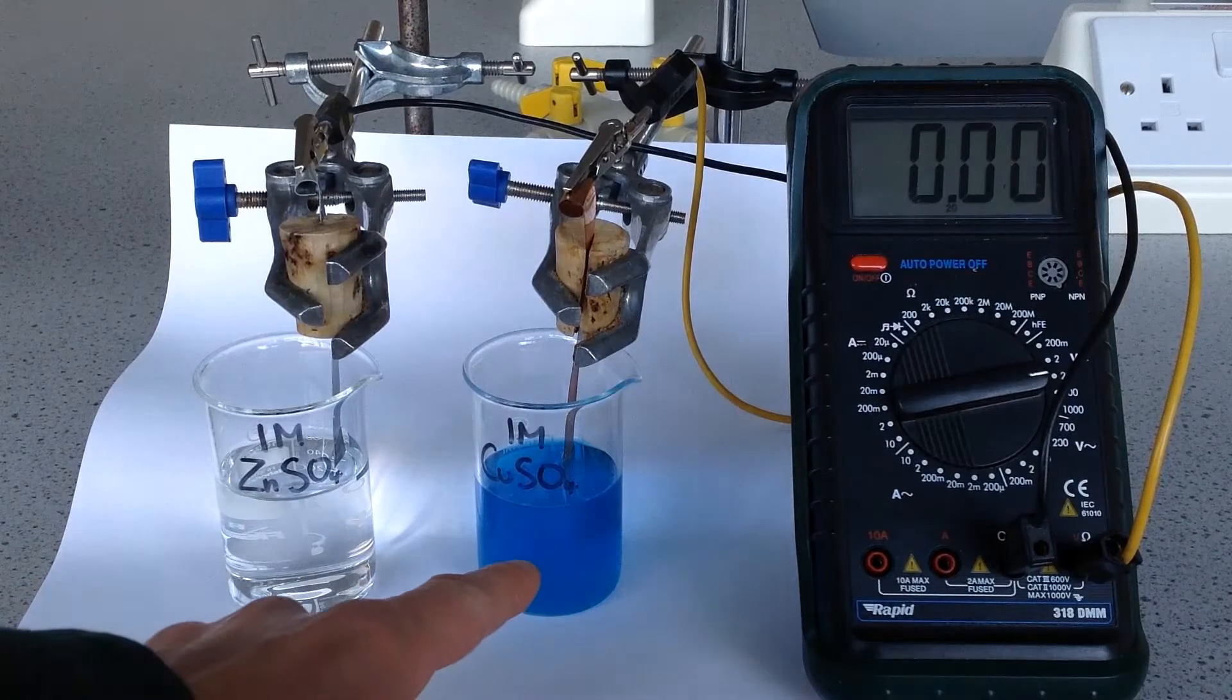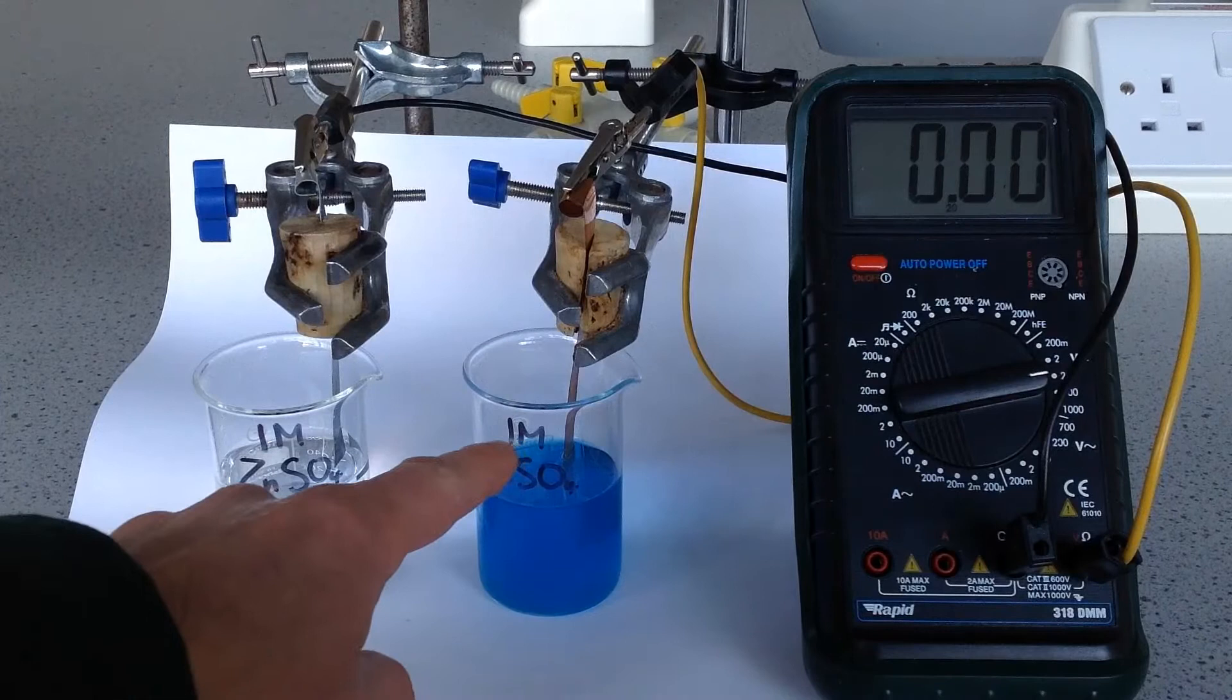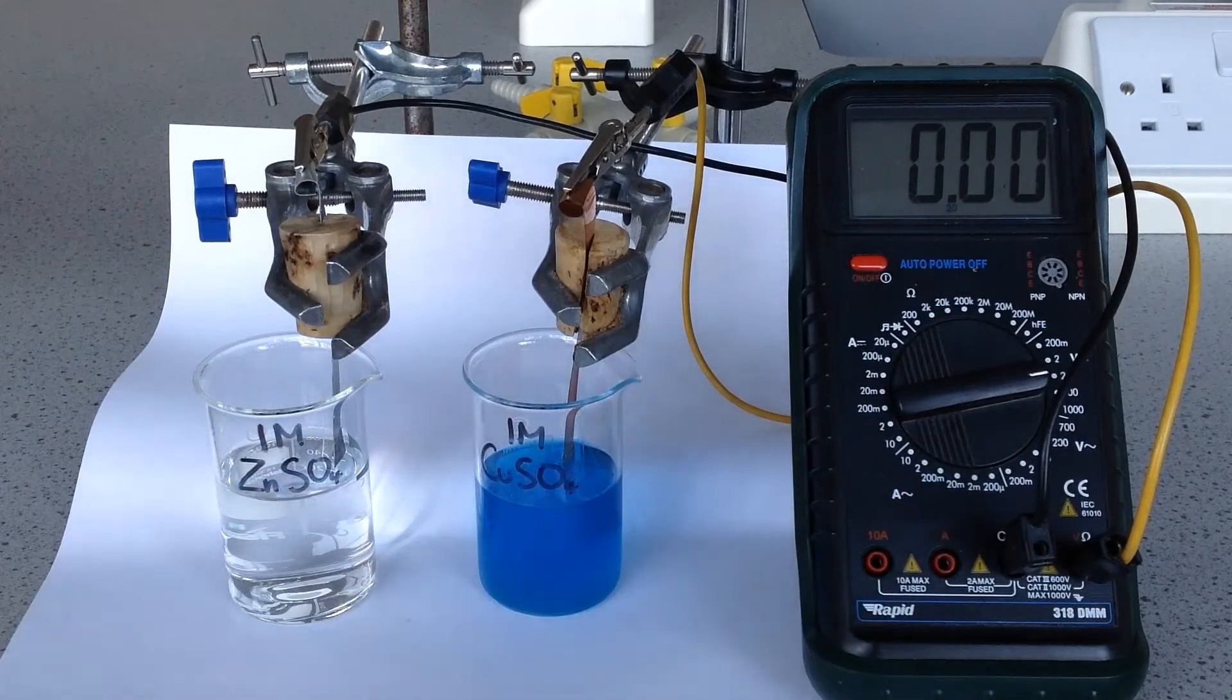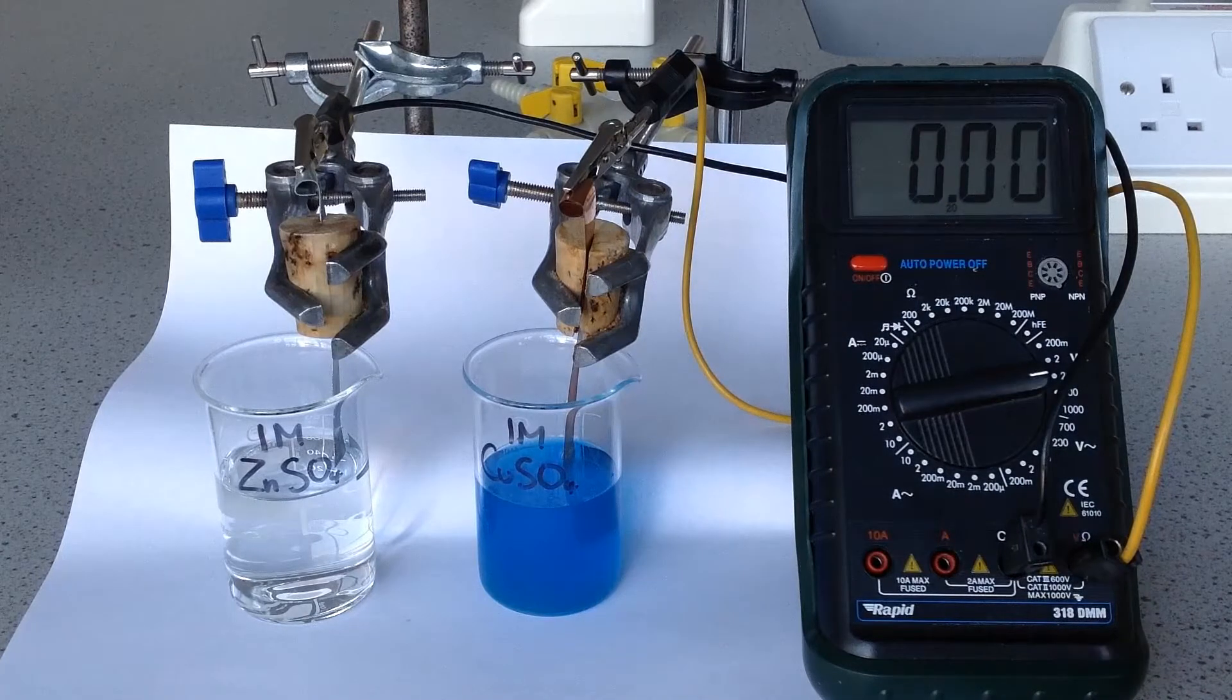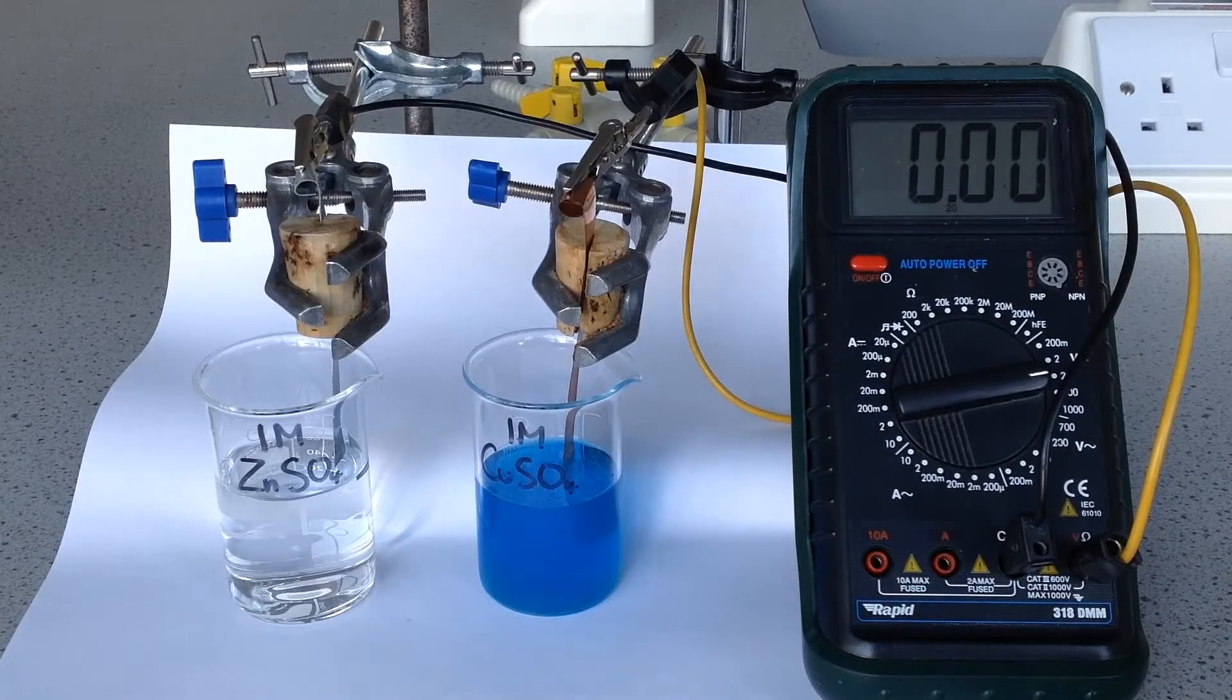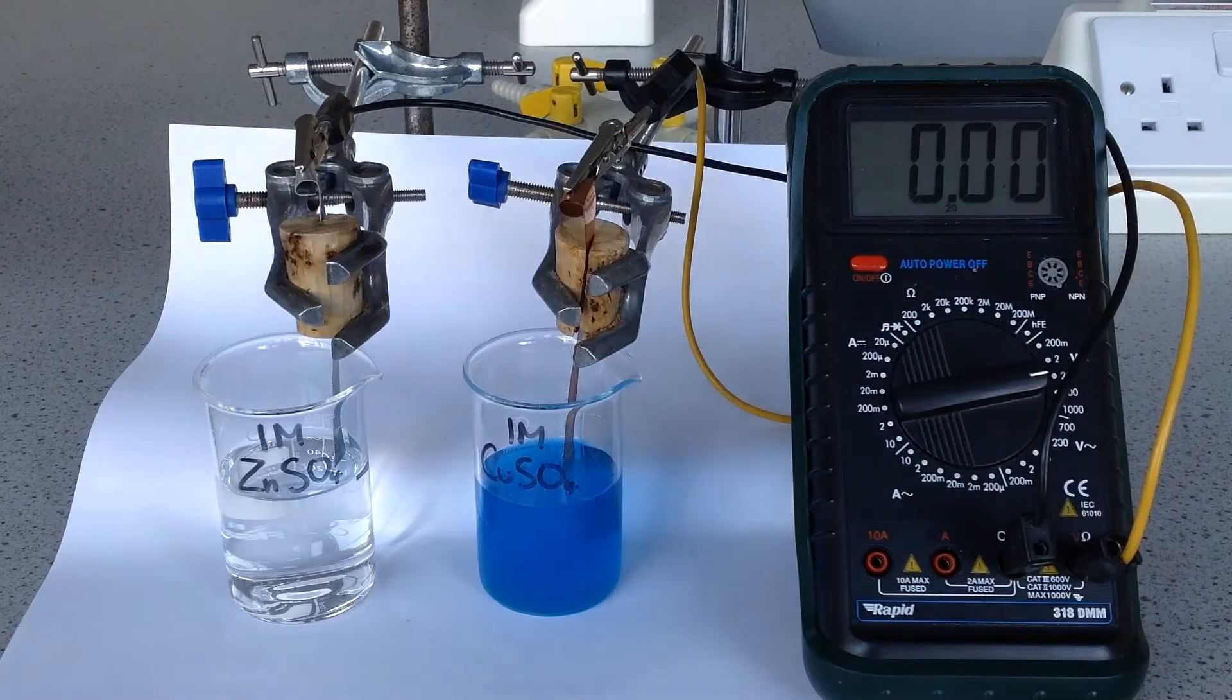And on the right hand side we've got the copper sulphate solution, one mole per decimetre cubed concentration and a piece of copper inside. And when we connect these up we're always going to need a salt bridge, so we've connected them up with wires to the voltmetre, currently reading zero.